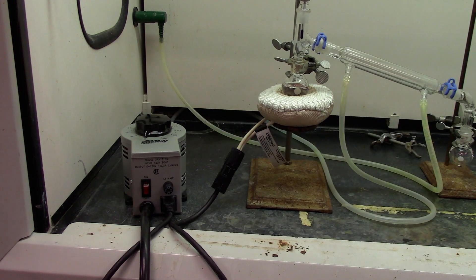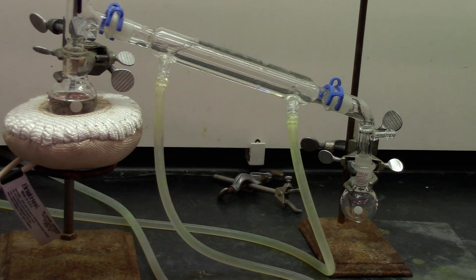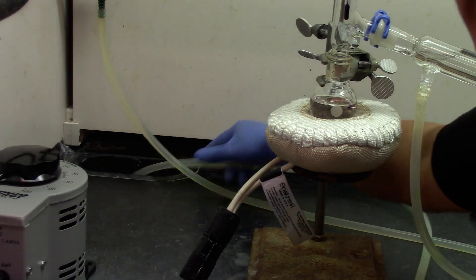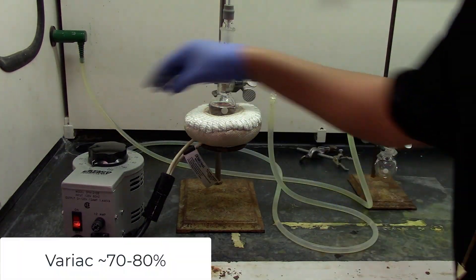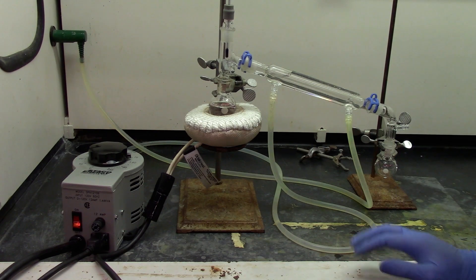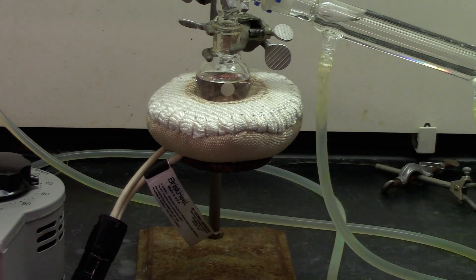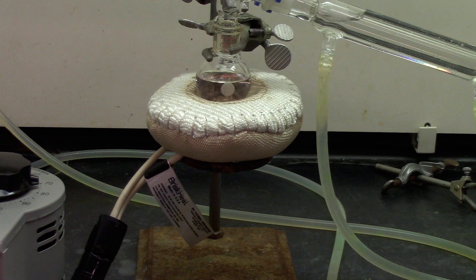Now it's time to turn on the water. Make sure the outlet has a good flow before you start heating the mantle. Turn on your variac and put the variac between 70 to 80 percent, and now we wait for the distillation to start. Once you start heating, it's a good idea to feel if the mantle is heating up. Sometimes if the mantle or the variac is broken, you may be waiting too long with no heating going on. So make sure your mantle is working once you turn on the heating.